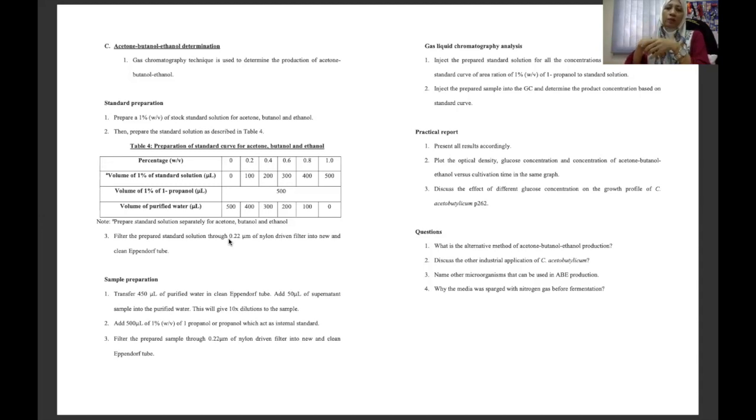The molecules present in the sample will block the column, so the column will be stuck and you cannot use it anymore. And bear in mind, for the high advanced instrument, the column itself is very, very expensive, right? So please, you need to prepare the samples correctly before you can proceed with the analysis.